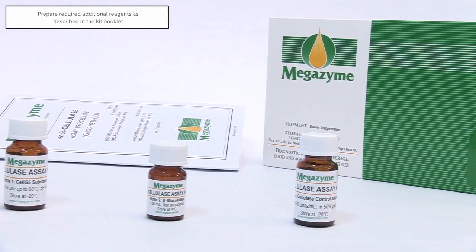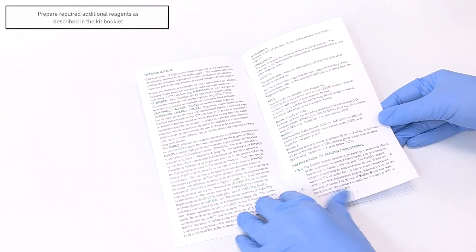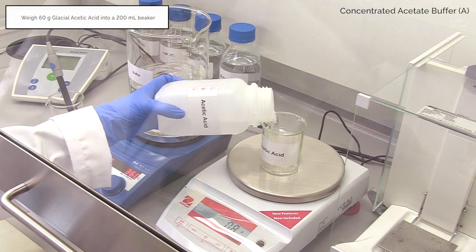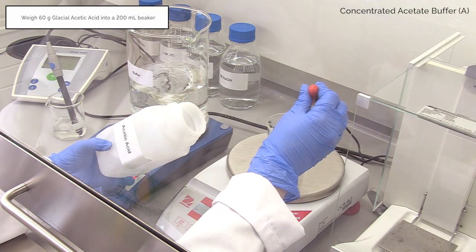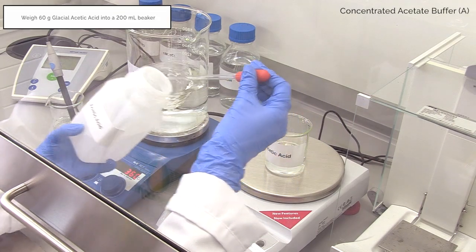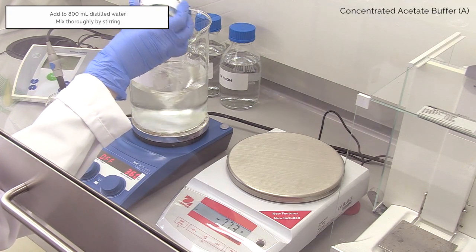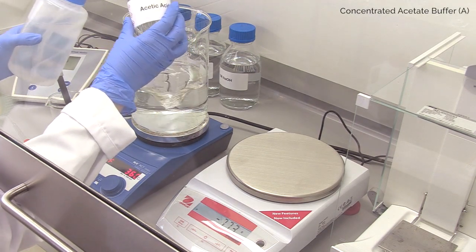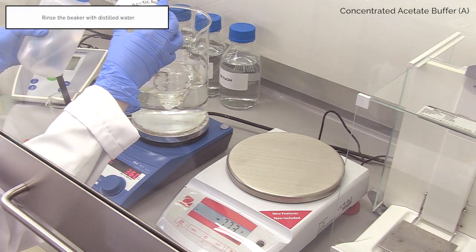Prior to sample analysis, prepare the required additional reagents as described in the kit data booklet. Weigh 60 grams of glacial acetic acid into a 200 millilitre beaker, then add this to a stirring beaker of 800 millilitres of distilled water marked buffer. Wash the original beaker into the 800 millilitres of distilled water using a wash bottle.